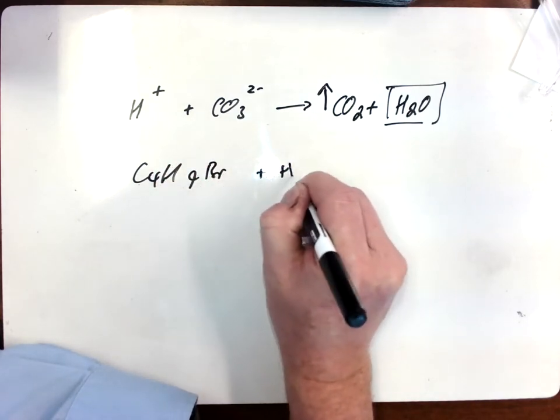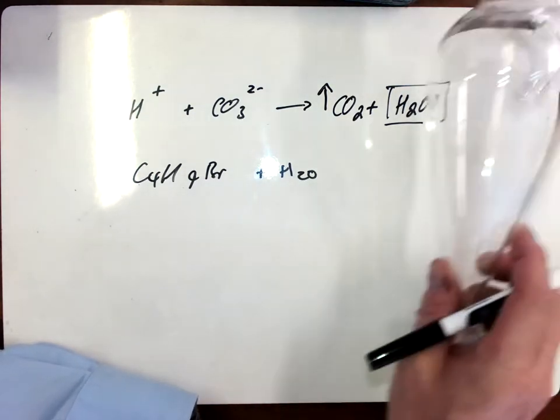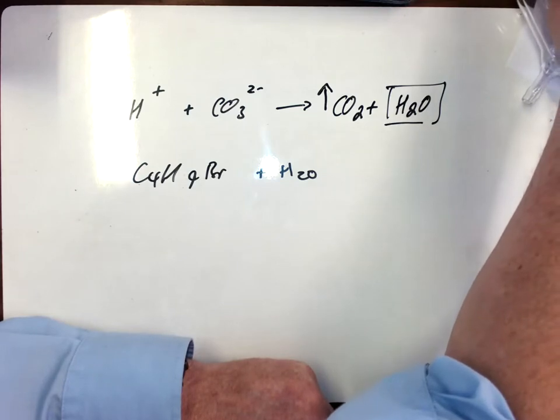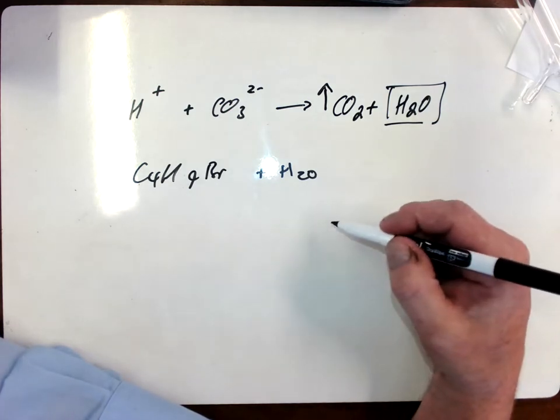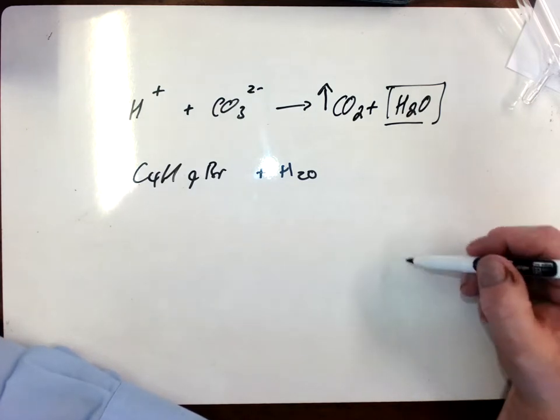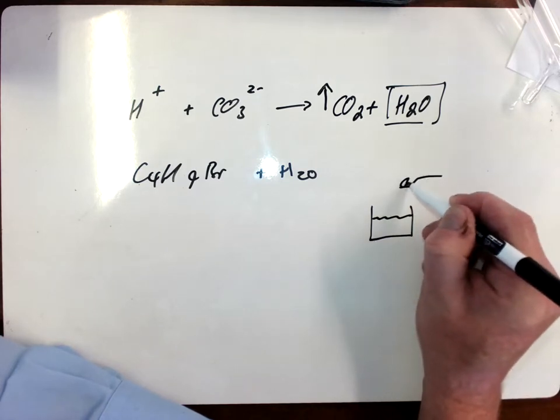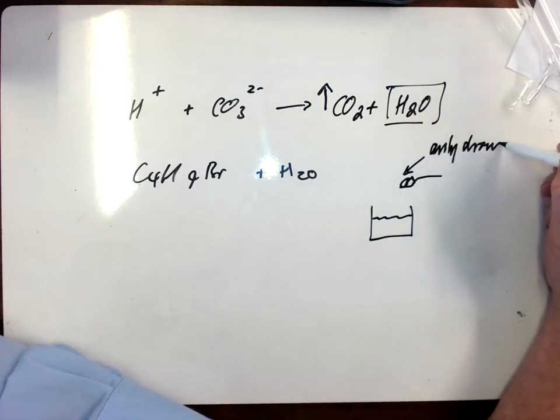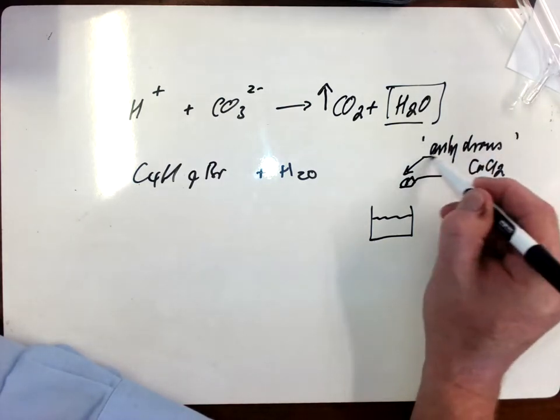1-bromobutane, our desired product. So our last step to get rid of the water is we run this crude or fairly pure 1-bromobutane now at this point, or whatever it is. It may not necessarily be 1-bromobutane, depends what the examiner asks you about, but as I said earlier, the method is still the same. And what we do then is we put it into a little beaker. We add a few granules, not many, okay, of a drying agent. Now the one that I would frequently use is anhydrous calcium chloride, and if you're asked to name a drying agent, you must mention the word anhydrous.